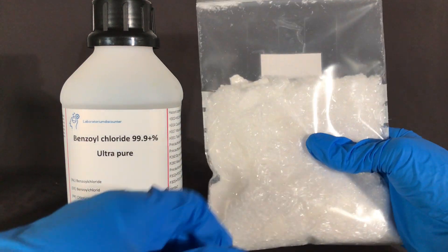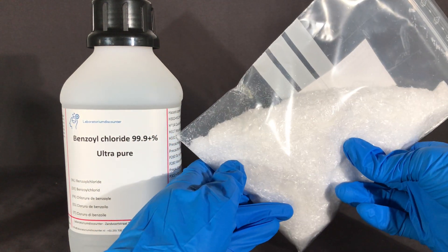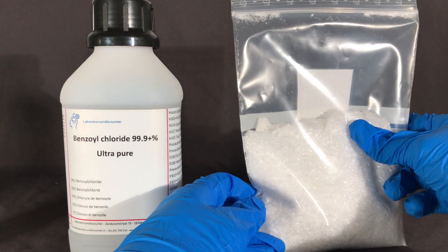Anyways, what's cool about it is that benzoyl chloride is a liquid, while benzoic acid is a solid. Benzoic acid is a solid because hydrogen bonds can develop, and with benzoyl chloride this is not going to happen.